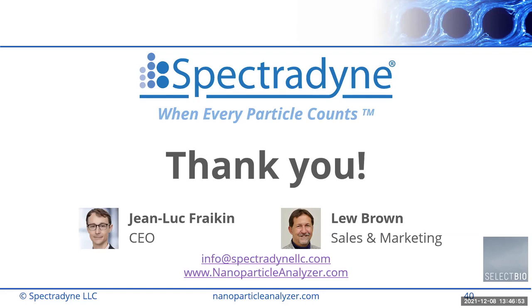Then, how do you get accurate measurement from 50 nanometers to the 1 micron range? I'd imagine that a microfluidic system big enough to detect the microparticles will be too big to measure nanoscale particles. And also, for particles smaller than 50 nanometers, do they just get left out, or do they get included somewhat as the peak at the minimum, say at the 50 nanometer range?